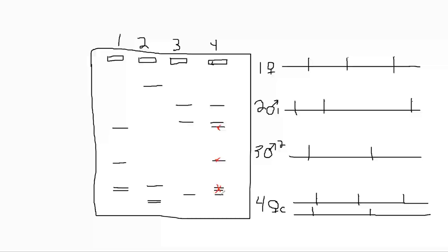They do not come from the mother, they have to come from the father. And so I made it easy, I've just drawn it right here. We know that segment is the same as this one because it's the same length on the gel. This is the same, and this is the same. So now we have determined that the biological father is the second male listed here, person number 3. Fun stuff.